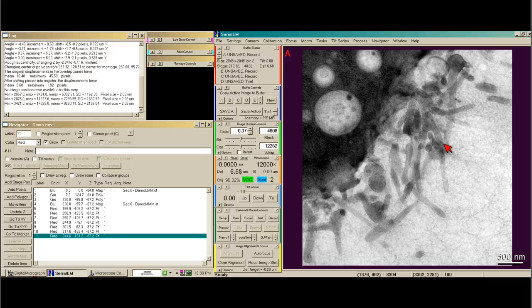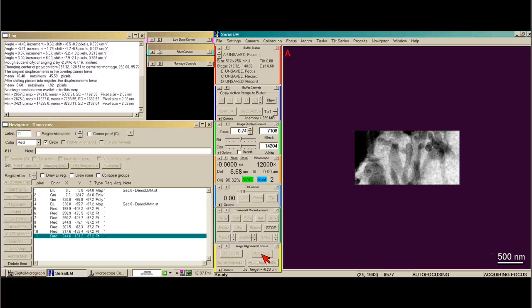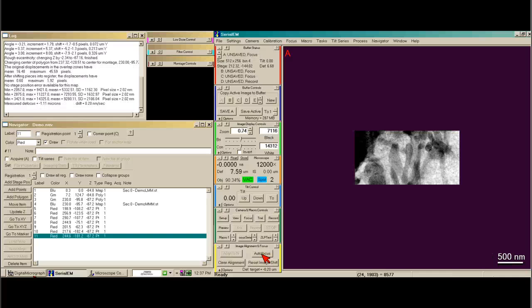Now we need to set focus levels. Right now my defocus target is just below focus, and that's what I want. So I'm just going to autofocus — this will take a series of three images. When we look in the log window, it tells us what the defocus was and then the drift at that particular place. Now that we're basically in focus, I'm going to reset my defocus so I can always get back when I need to.